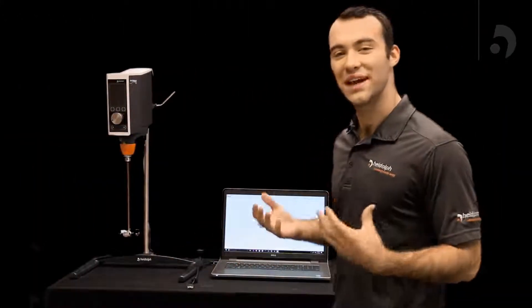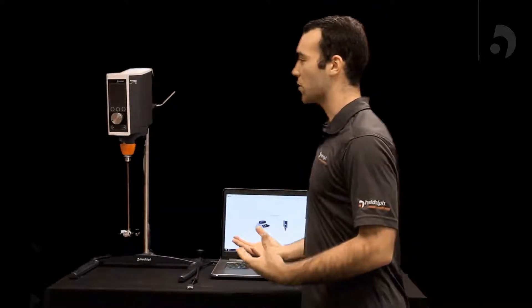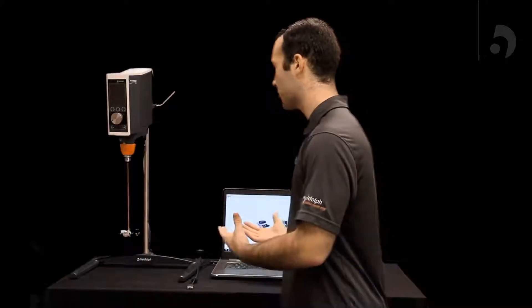Hi, I'm Nate from HiDolph and today we're going to be working with our HiTorque and our HiControl software. The HiTorque Precision line is the line that is compatible with the software.